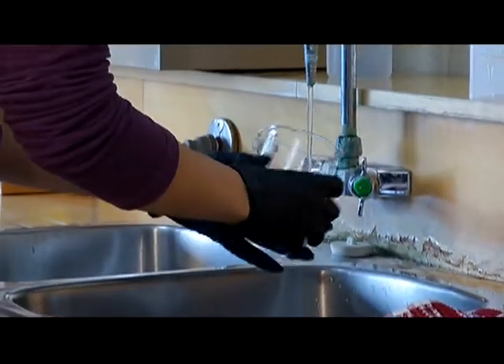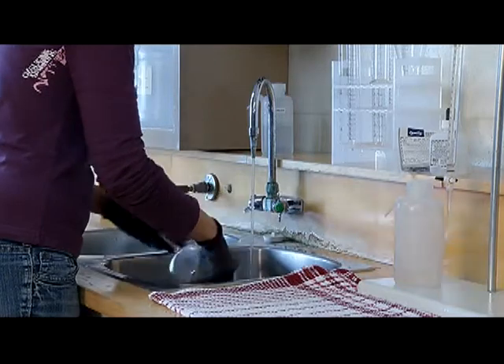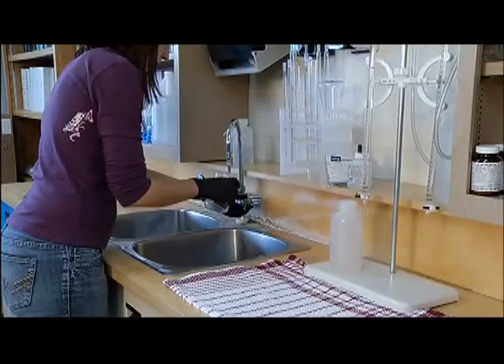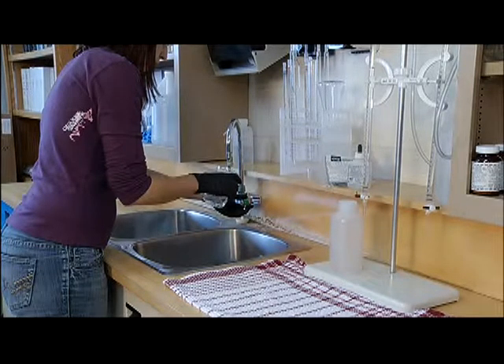After the water has flushed for 5 minutes, rinse the sample container 3 times to remove contamination from previous samples, slow the flow of water from the tap, collect the sample, and move to the testing area.